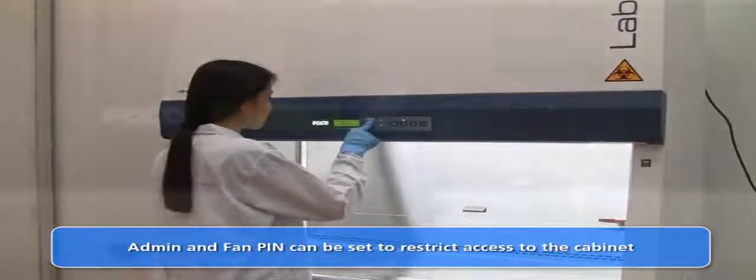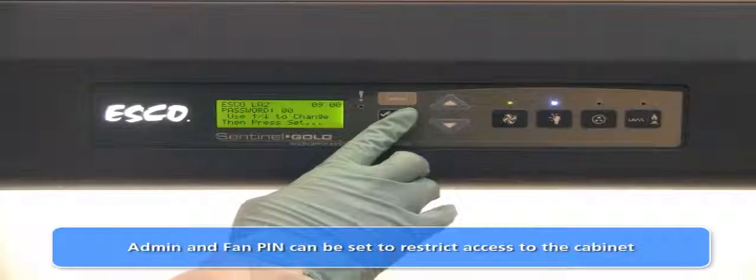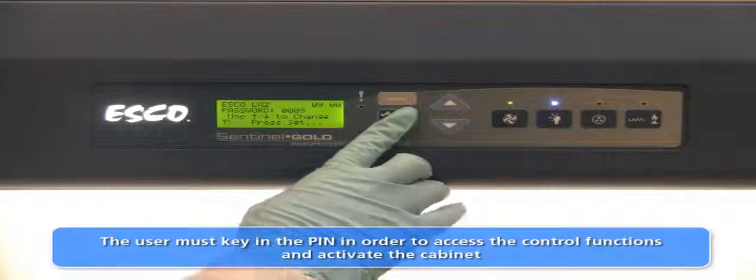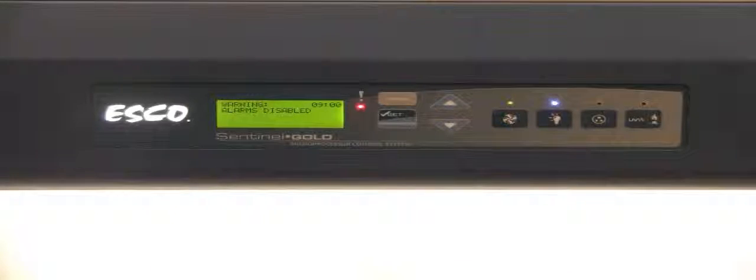For security purposes, access to the cabinet menu and operational functions may be restricted by setting password locks. The laboratory supervisor may use this feature to restrict cabinet access by unauthorized personnel. However, the use of the quick start mode will disable the fan PIN functionality.